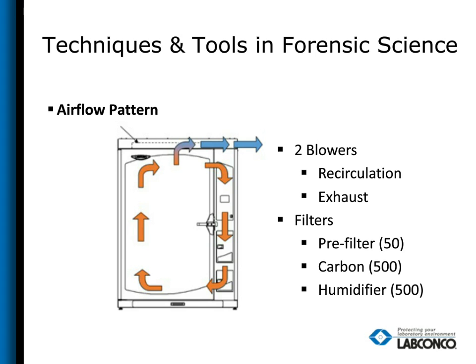When we're using an automated system, the exhaust actually turns on and doesn't require the end user to be standing there. They work good until they stop. And not knowing the proper amount of glue to put in your tin, the volume of your chamber, and how your exhaust works actually leads to overfuming and damaging of evidence.